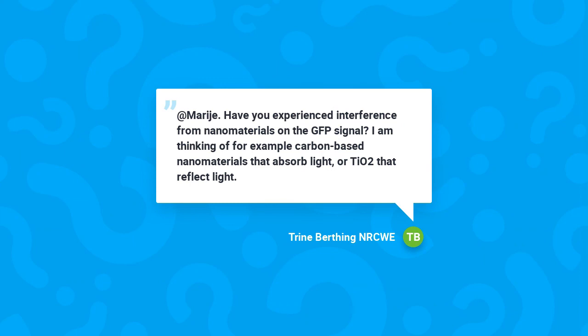Yeah, that's indeed a good question. So we have tested up until 100 micrograms per milliliter, and indeed with the highest concentrations there's so much saturation of these nanomaterials that it will interfere with your GFP signal. But it was primarily for the highest concentration that we tested.